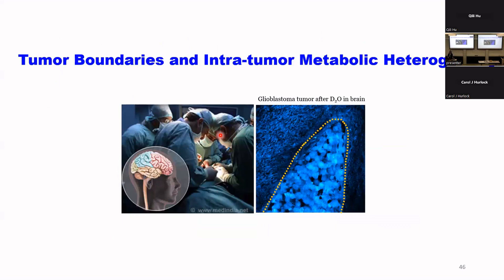So this is also great for tumor detection because tumors are dividing so fast. They generate a lot of CD labeled new protein and lipid molecules, and we can easily catch that intensity increase in these tumor cells. These tumors are growing inside the brain, and the surrounding area is brain tissue. The brain tissue doesn't have that kind of signal. However, the brain tumor cells have a lot of CD signals. So you can see how easily the surgeon can detect these tumor cells and remove them. Because if they stay inside the brain, they will grow into a big tumor very, very fast.